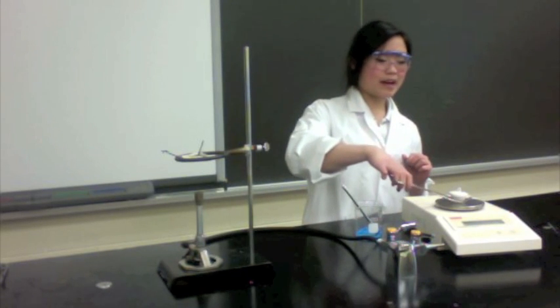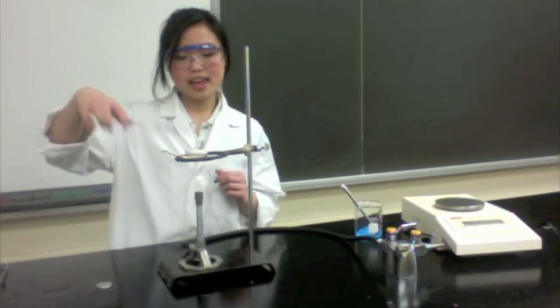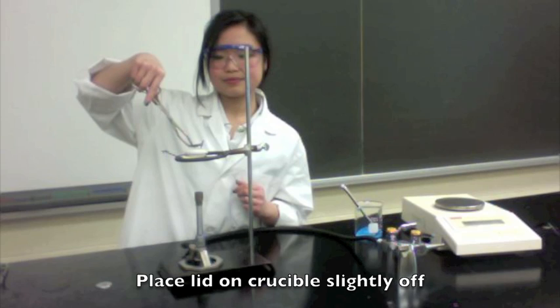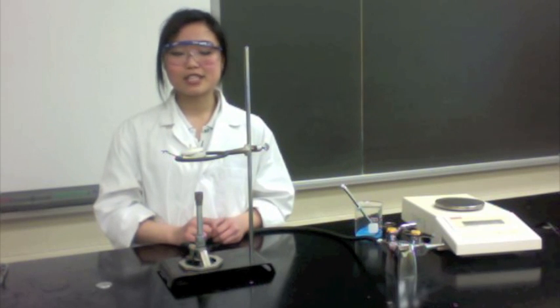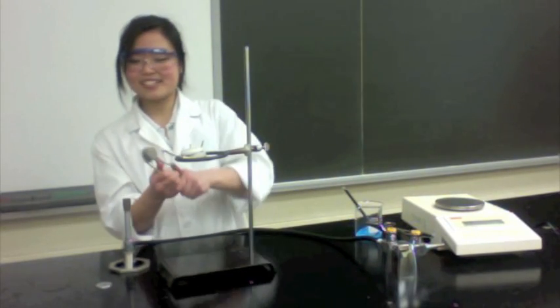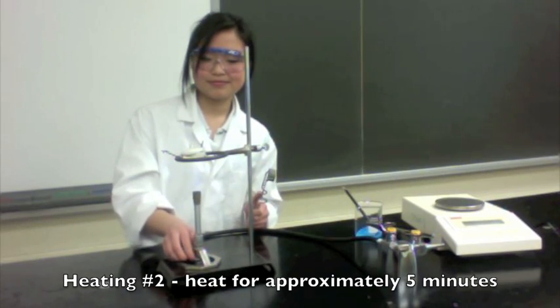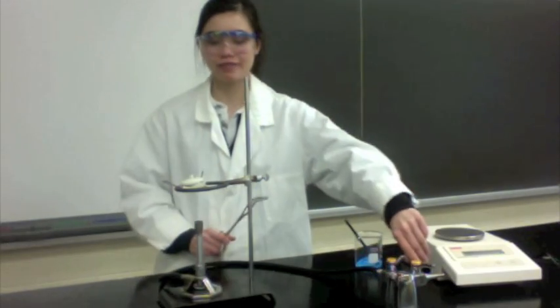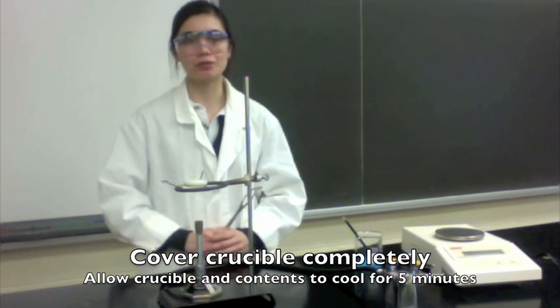Now that you have recorded your mass, you have to reheat the crucible once more. Bring it back to the clay triangle and leave the lid slightly off. You must reheat this for another 5 minutes to make sure all the water is completely driven out of the hydrate. Turn on the gas and ignite your flame. Once done, turn the gas off and using your tongs place the lid right on top of the crucible again, and allow it to cool down for another 5 minutes.